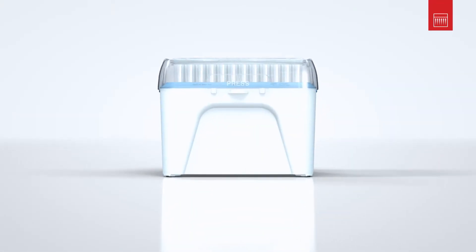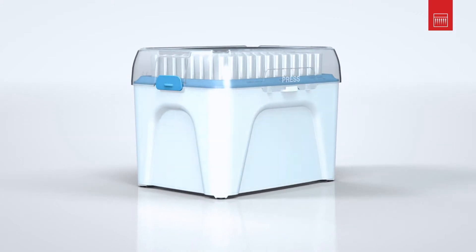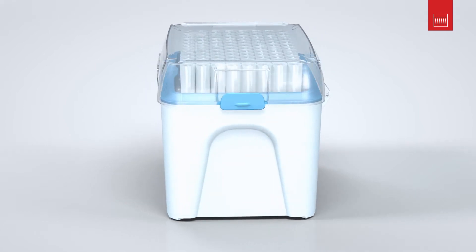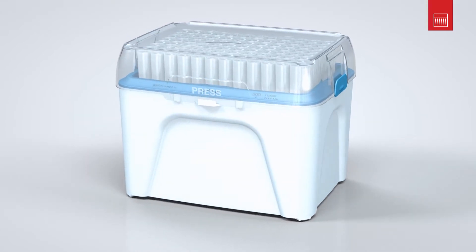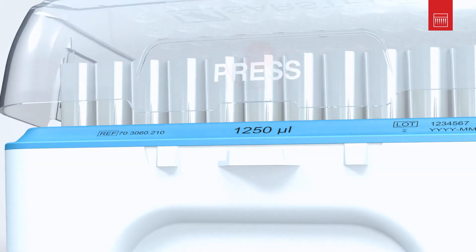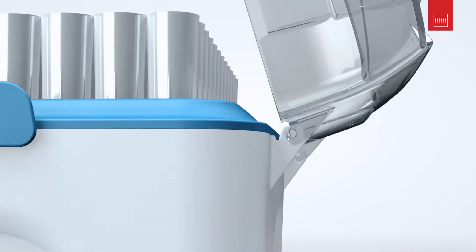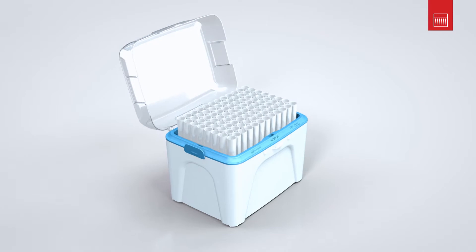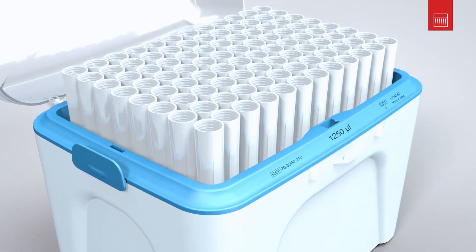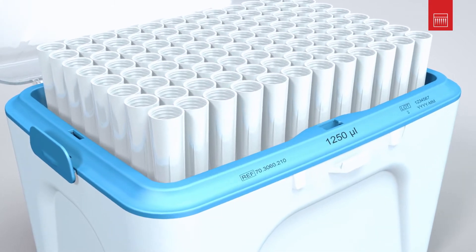Pipetting is at the heart of every laboratory. The box is the centre of our tip system. Apply gentle pressure to the box's ergonomic lid and it opens with ease. Thanks to the familiar and proven colouring of the trays, you can easily identify the required tip size at a glance.